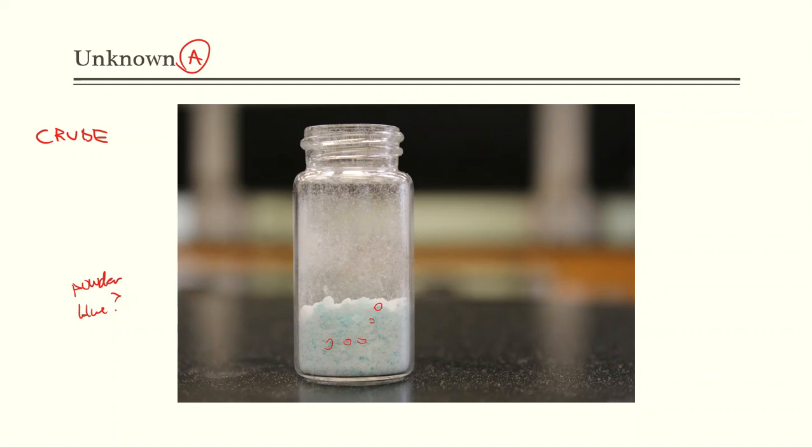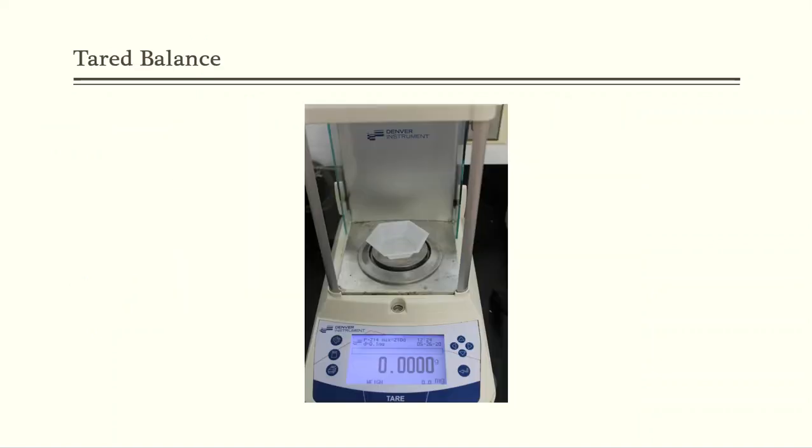But using this kind of bluish stuff as a visual, we know it's there and we know we need to get rid of it. All right, so at the very beginning of the lab experiment, I just went over to our analytical balance.